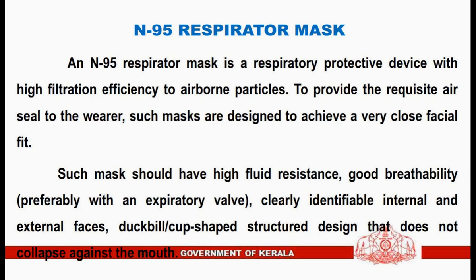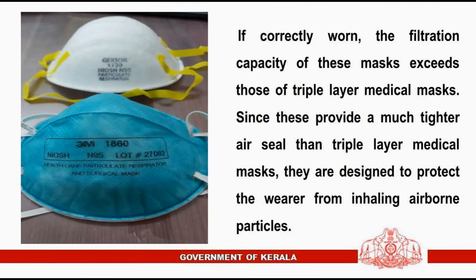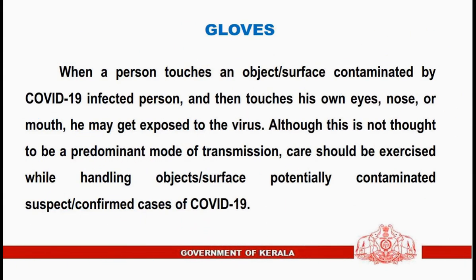Such masks should have high fluid resistance, good breathability, preferably with an expiratory valve, clearly identifiable internal and external faces, and a duckbill or cup-shaped structured design that does not collapse against the mouth. If correctly worn, the filtration capacity of these masks exceeds those of triple-layer medical masks. Since these provide a much tighter air seal than triple-layer medical masks, they are designed to protect the wearer from inhaling airborne particles.